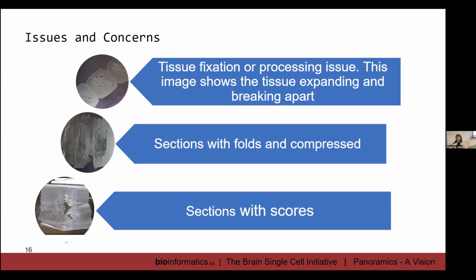Because when you go deeper into the block, you have to remember with diagnostic blocks, they've already been cut previously. So now I'm going to be the second person cutting it. And then I go in, I'm like, what's this? And normally what you'll find are the weirdest things: staples, sutures, my favorite, calcium in the block. And this is actually extremely difficult to get out once it's been processed.